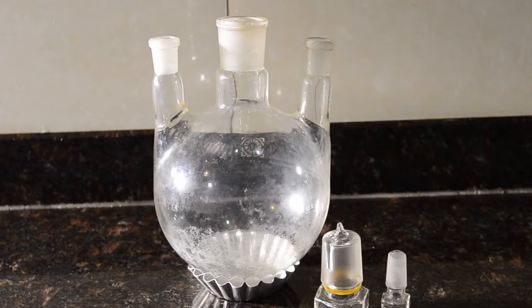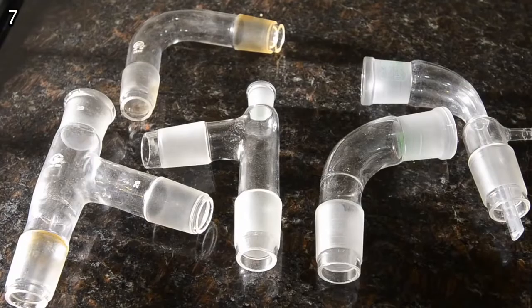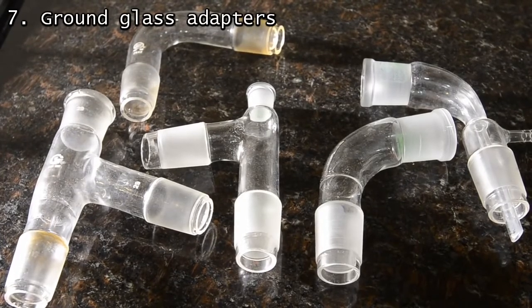Multi-neck flasks are very useful but are hard to find. We have a 500 ml one and a one-liter one shown here for very large reactions. Just remember to have stoppers so that you can seal off the necks that are unused. As far as ground glass goes, we have a few different adapters, mostly for distillation.